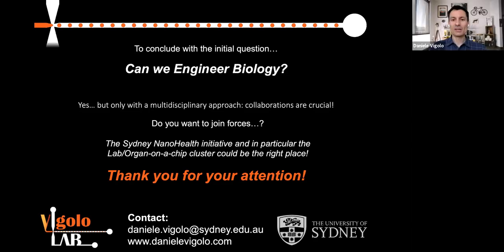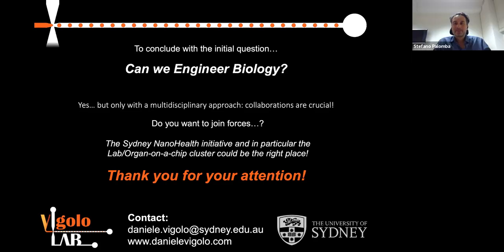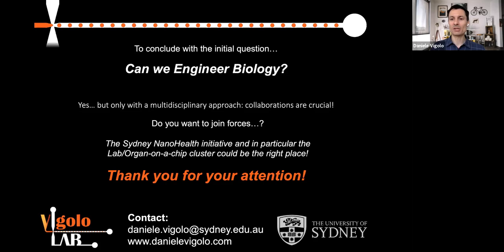Yeah, thanks. This is a very important question, and it would probably take another hour of discussion to answer, and we probably would not reach a final answer. I'll try to give a two-minute version. I think you're absolutely right. Real organs, real tissue, are obviously complex. There is a three-dimensional nature that is unavoidable. But there are some specific aspects that you can reproduce.